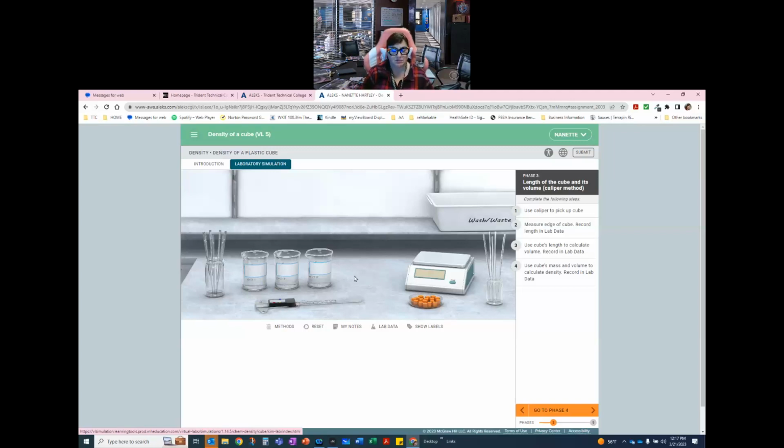And density is something where it's mass per volume. And based on that mass per volume, we can find that things that are more dense will come down, things that are less dense will float, things that are about the same density will be suspended. Okay, so we can figure out what the density of something is even without being able to directly measure its weight and volume by using combinations of solutions to do this.